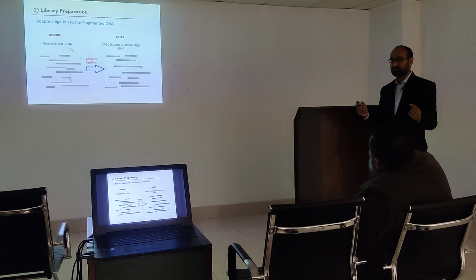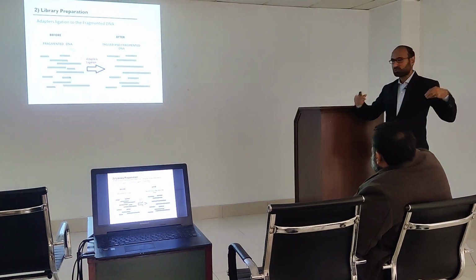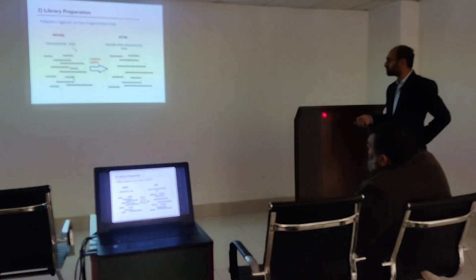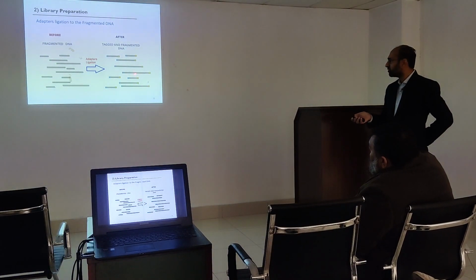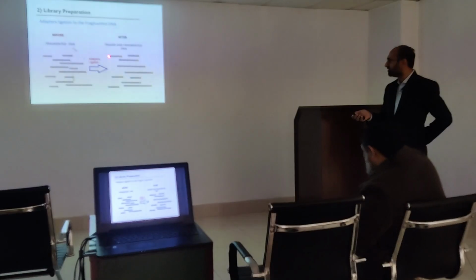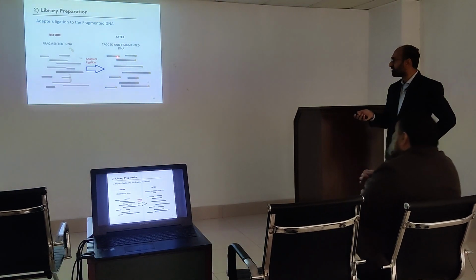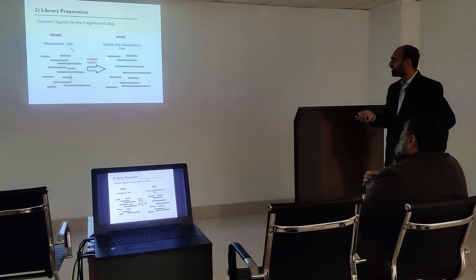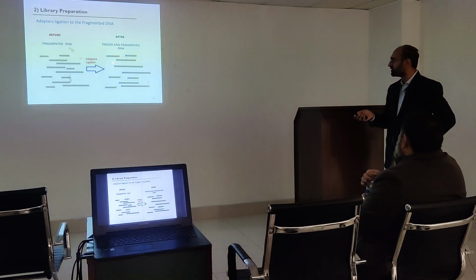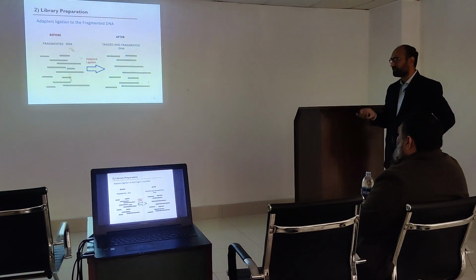These adapters are ligated to the ends of DNA so that the library comes to this format: on each strand there are known adapters at the left hand side and right hand side. The sequence of these adapters is known to us. So now we can use primers which are complementary to these regions, and those primers can amplify all these fragments simultaneously.